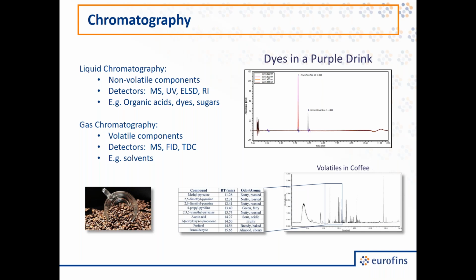Another valuable technique is chromatography. We utilize both liquid chromatography and gas chromatography in our analyses. These are great for things that are dissolved or within the product. For liquid chromatography, we're going to look at the non-volatile components, such as organic acids, dyes, sugars.